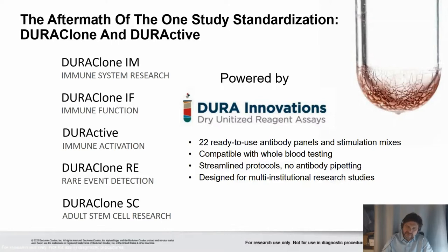So that's not a lyophilization technology. And this layer would be firmly attached to the assay container. And just by adding your sample, you would dissolve the layer and you would basically be back in the world of very conventional flow cytometry, now following the standard protocols to process the sample.